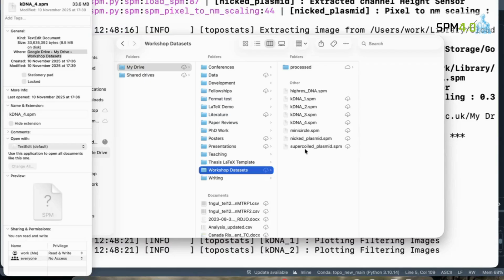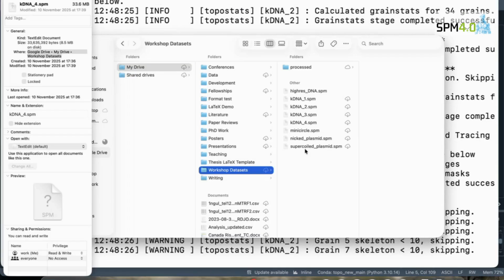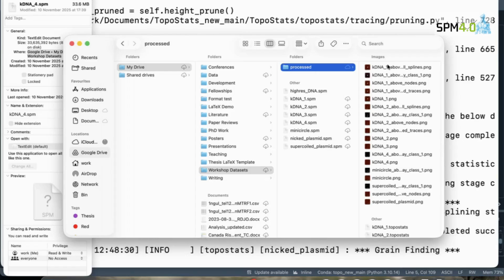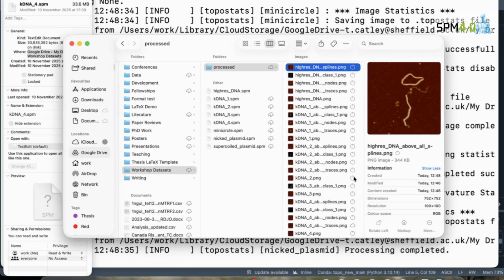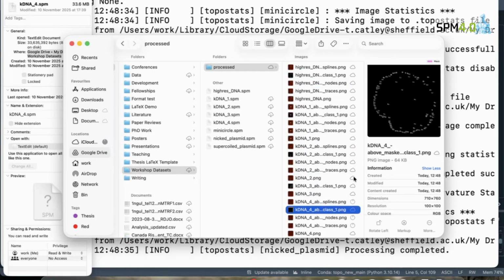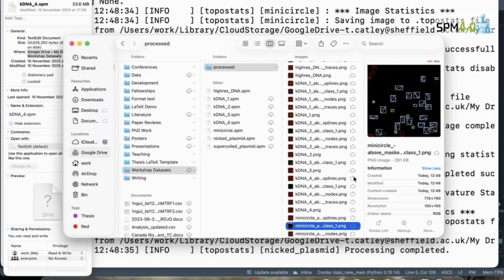Right. So we can show what's on this. Maybe this is, like, you do it, I have to do it for a second.